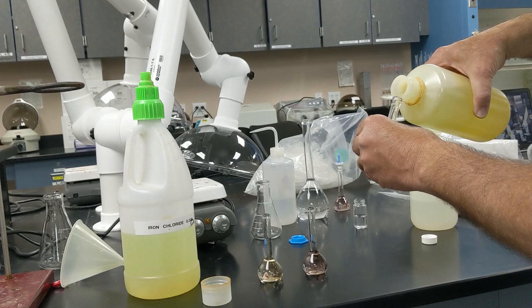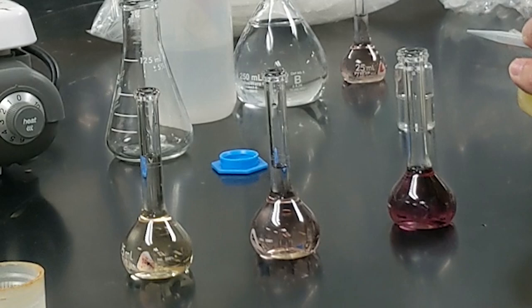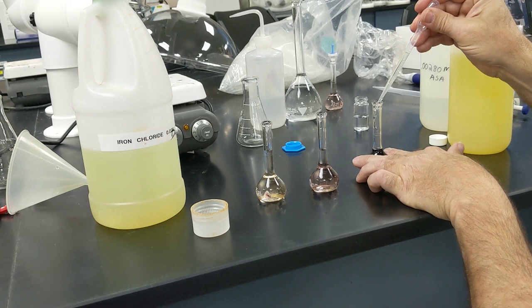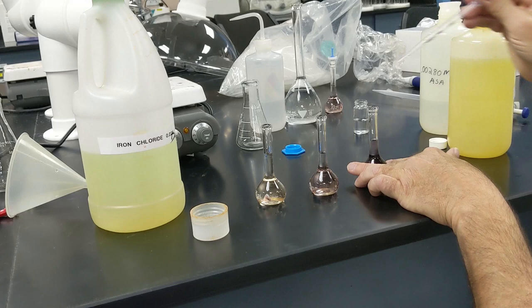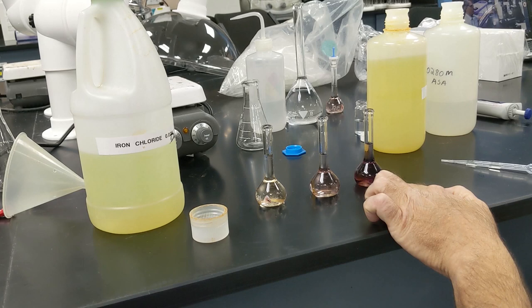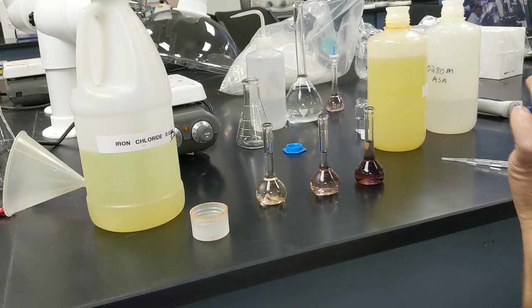Okay, so what we're seeing now is the hydrolyzed aspirin, or ASA, reacting with the iron 3 reagent to develop the colored transition metal complex. And since we used 1 ml for the first one, 2 mls for the second one, and 5 mls for the third one, you can see that the color develops to become more intense as the concentration of the sample increases. Okay, so that's it for this part.